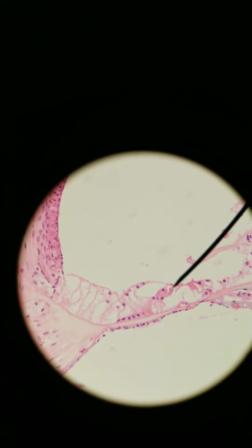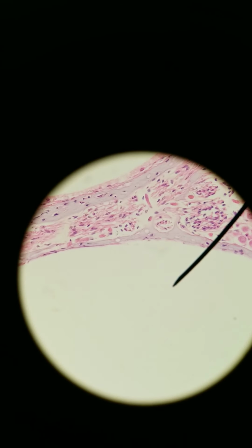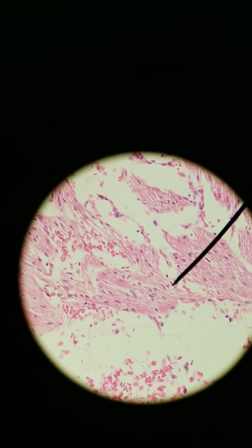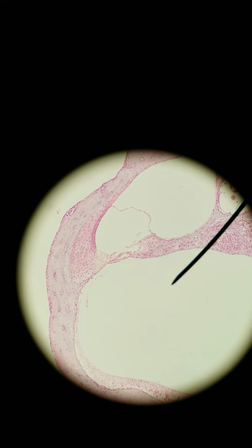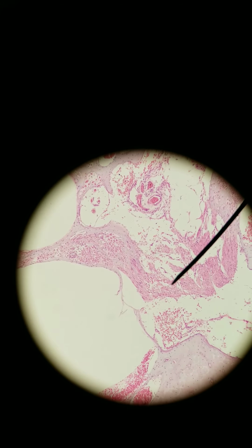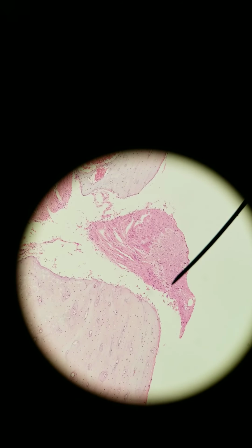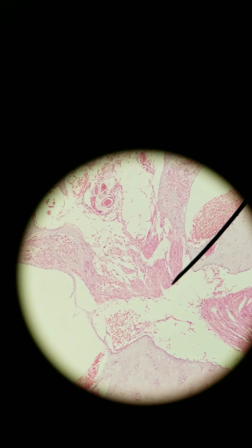And so these receptor cells, hair cells, you've got your, which way is the neuron? The neurons will exit this way. So these are a little easier if I zoom back out. We're at 100x. The cochlear branch of the vestibular cochlear nerve is going up right here. You can see, and also out here. All these are axons. So this is cranial nerve number 8, the cochlear branch of cranial nerve number 8.